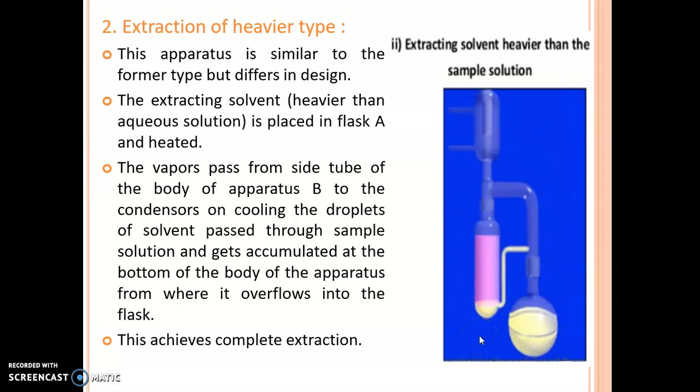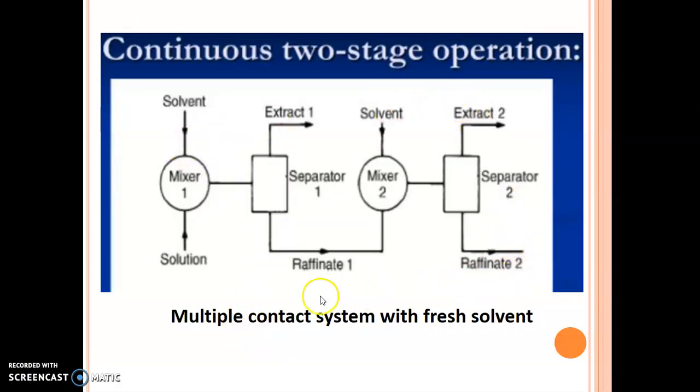Okay, so here two types of apparatus are used for lighter type and heavier type. Same apparatus system but minute changes occur. Okay, so here you can see a tube is present. This diagram shows the separation method.